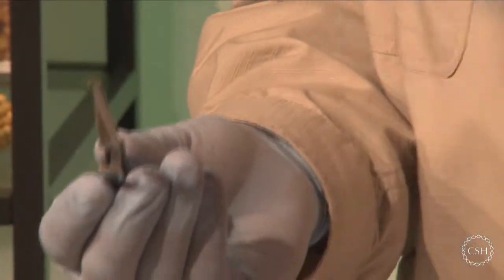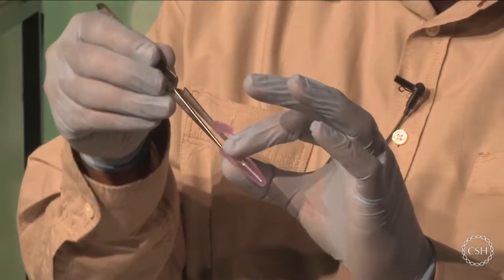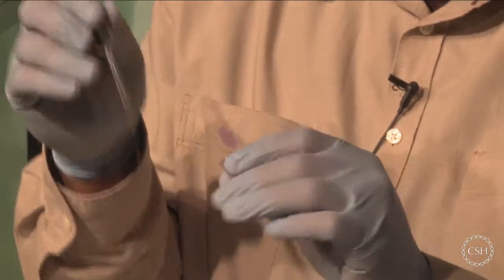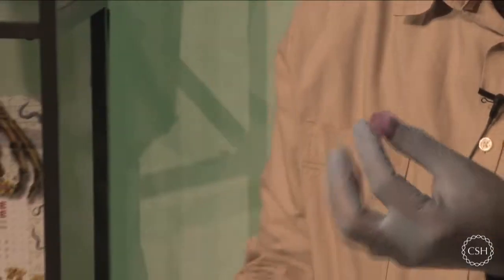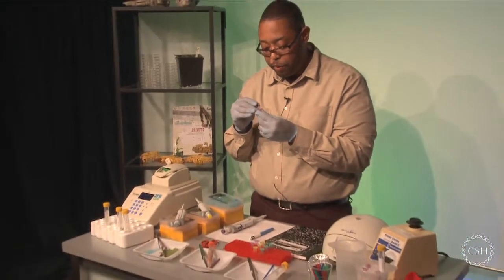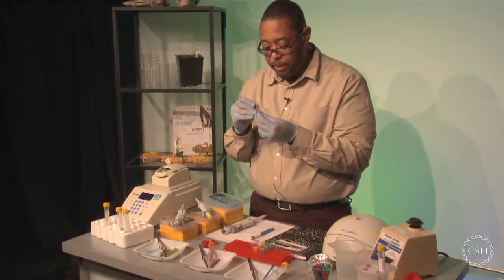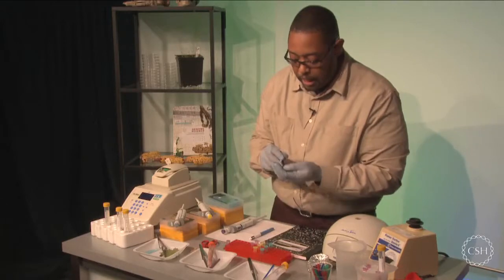So I'm going to take one of my test tubes now, and I'm going to add my tissue, okay? So my tissue is now in that test tube. I can put my forceps down, and now I can label this individual test tube. This will be sample number one. Make sure you label the top and the side, and also that it is a plant. Okay? So here's sample number one.